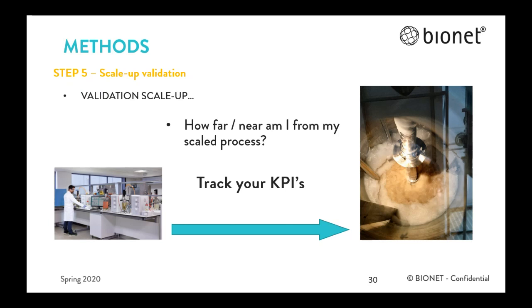Another aspect making the situation more complex is that some operation conditions necessary for adequate mass transfer can produce negative effects. The local environment of the cells in large-scale industrial bioreactors varies over a higher range than in small lab bioreactors, because of the high heterogeneity of the cultivation medium caused by the longer global mixing time. The turbulence intensity, and thus local shear forces, are exacerbated with the increasing scale of bioreactors. Under this condition, cellular stress can affect the growth.